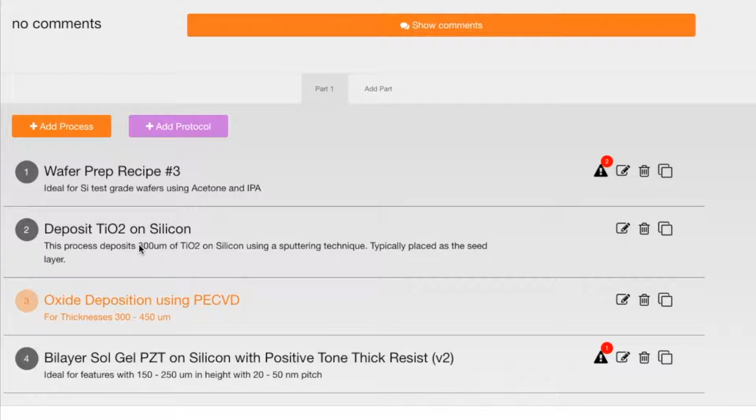In this video, what we're going to be talking about is the difference between what we're calling a known recipe, a recipe that everybody in the lab is using, and then what's called a user recipe, what's just you individually that you're still starting to work on. And the first sign that you'll see here, I went ahead and added one. You'll see a couple of gray recipes, and those are indicating that they're known recipes. And what that should tell you is that these have been vetted, tested by multiple users inside of your lab and can be counted as reliable, so to speak.